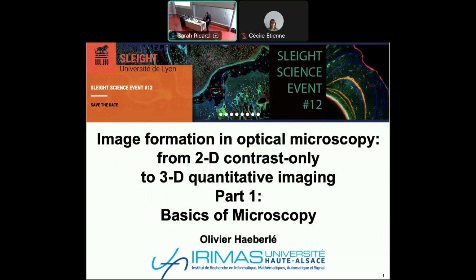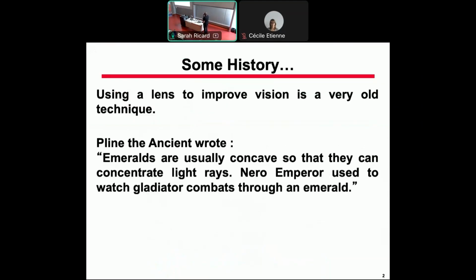So I say the first part will be a re-identification of a little bit the basics of microscopy, to start slowly. So about the conventional techniques of microscopy, I would say every microscopist should know. So just to go slowly, it's the beginning of the afternoon.